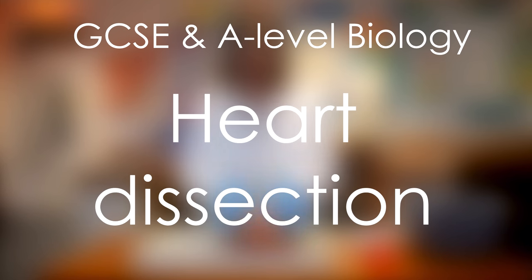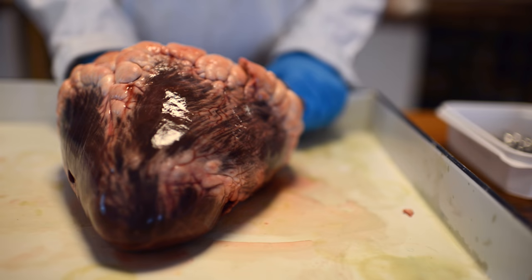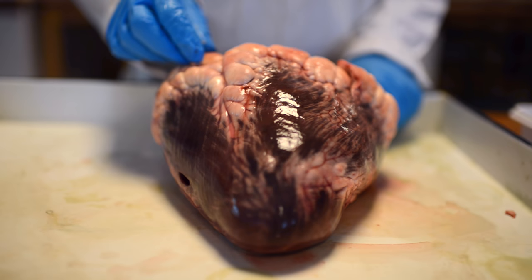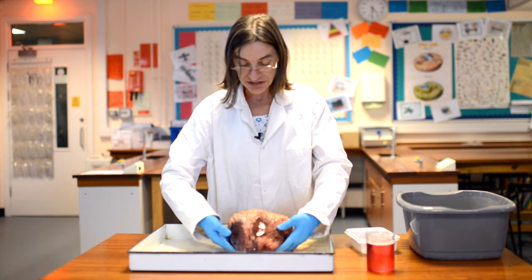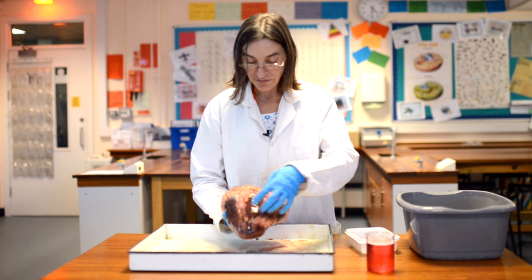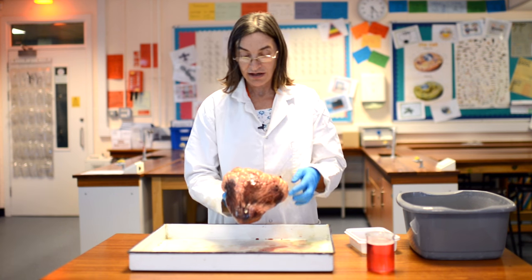Okay, now what I want to show you is how I would dissect a heart if I was demonstrating it to students. So, first thing we need to do is have a look at the heart. I've positioned it in the same way as the heart would be positioned actually inside the animal's body.